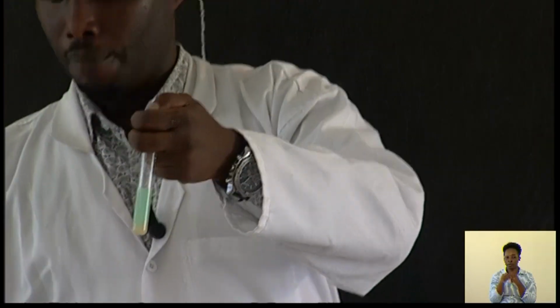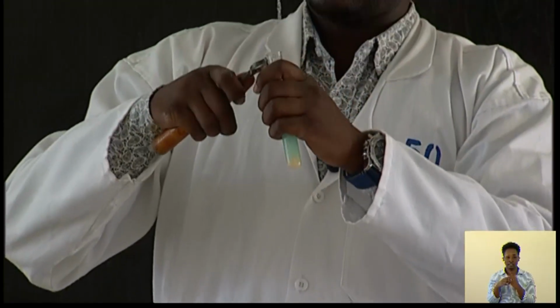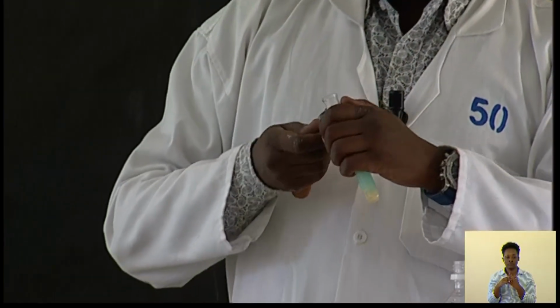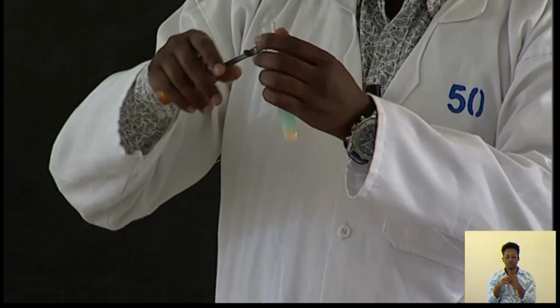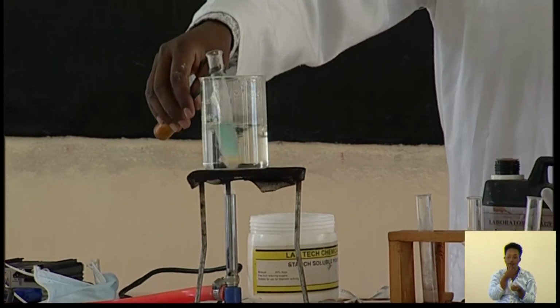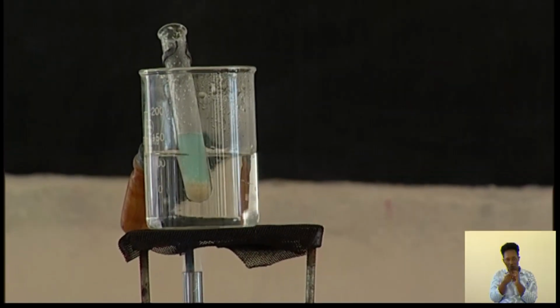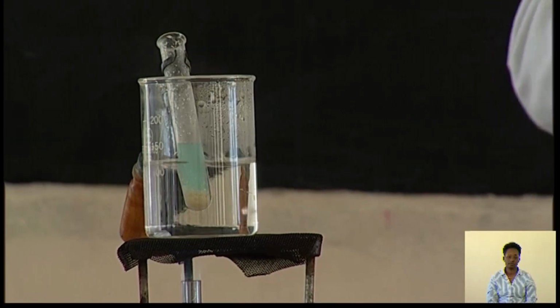Now from there, I have to get another one, and I put it in boiling water. Automatically, I have to make an observation. The observation is concerning color changing. Okay? It will be blue.